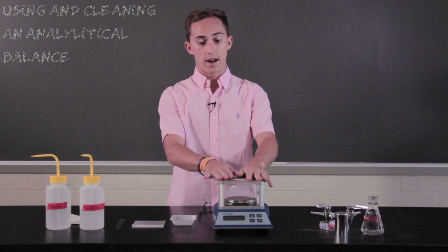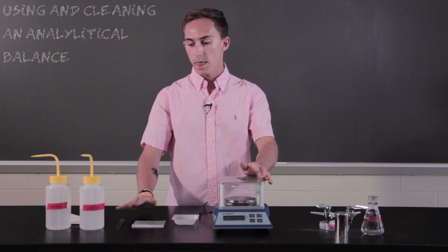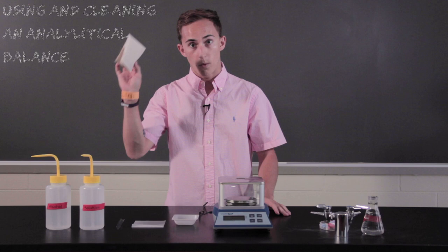Right here we have our analytical balance, we have our weigh boat, we have our weigh paper, we have our scooper, we have our solution, our cleaning alcohol, and a little wipe.